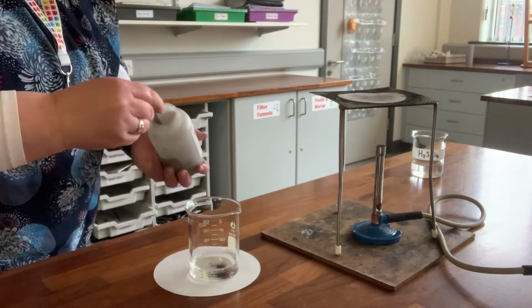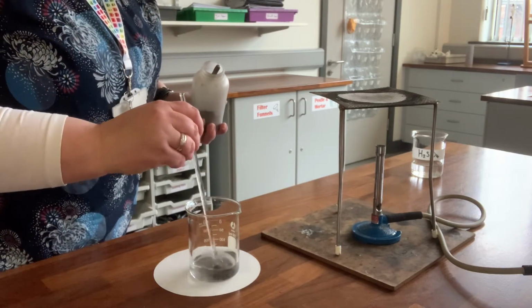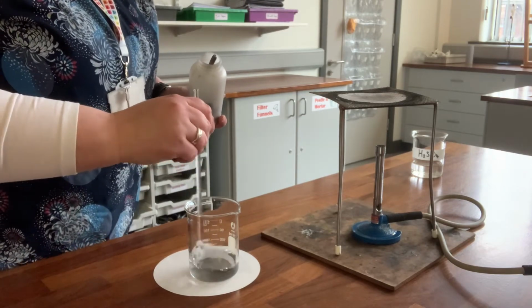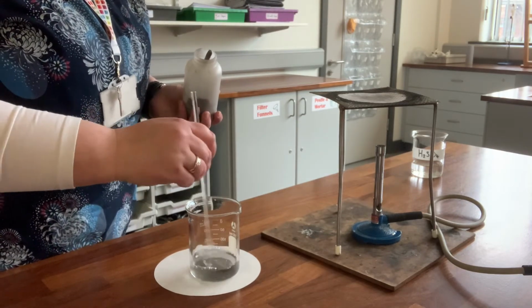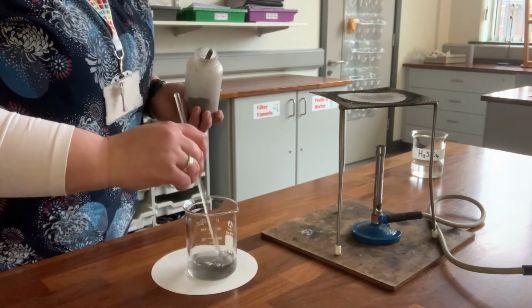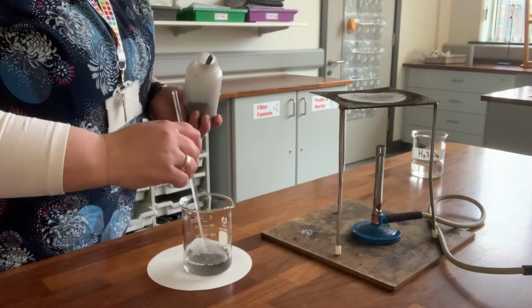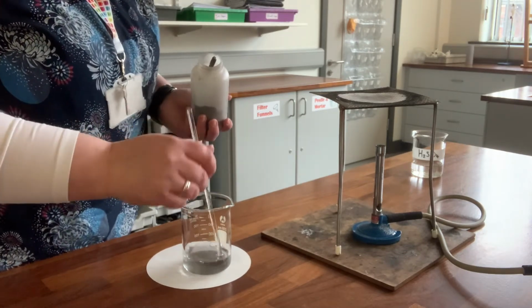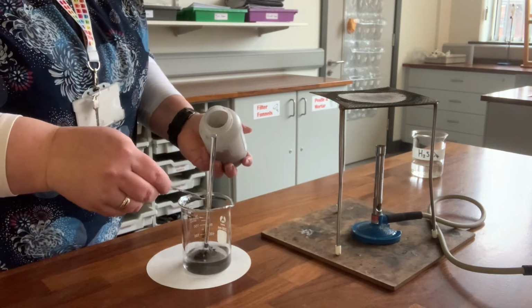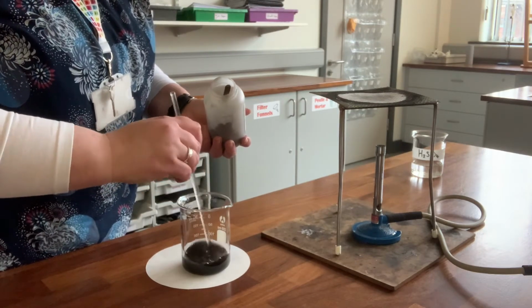So we add a little bit. What you will notice is that the black powder will disappear or dissolve when it reacts with the acid. So when I stir this, you will notice that some of the black powder will disappear or dissolve. Now in this particular experiment, we want to make sure that all of the acid is totally neutralised. So we're going to keep adding our copper oxide until we have it in excess. That means that there's more copper oxide than there is acid.